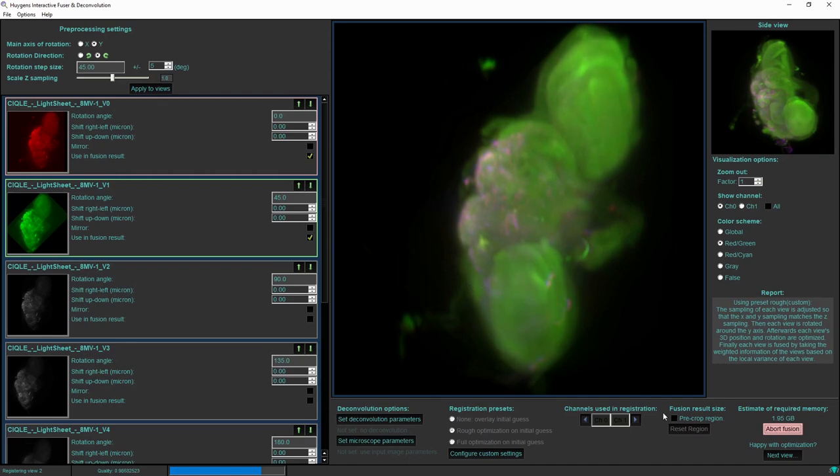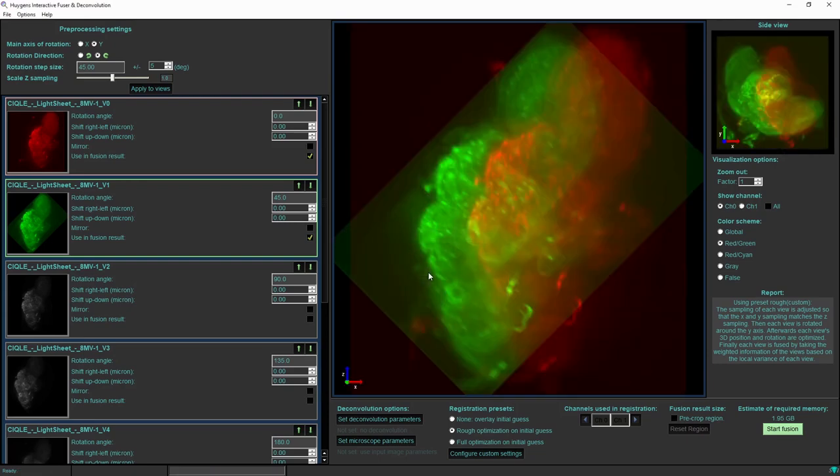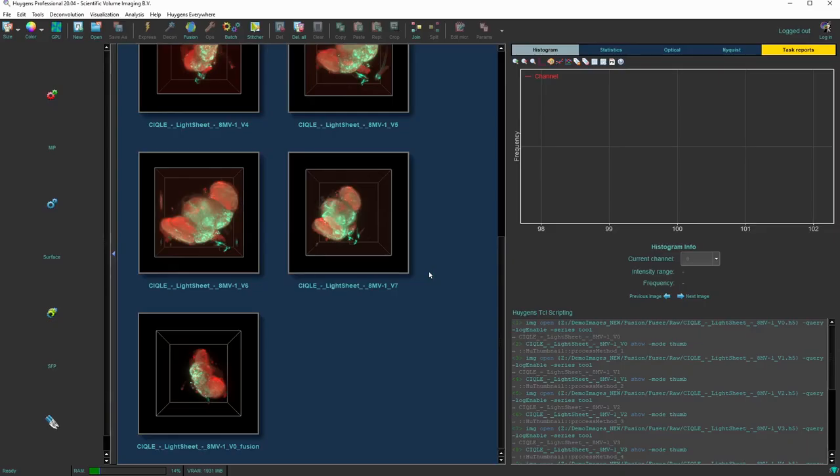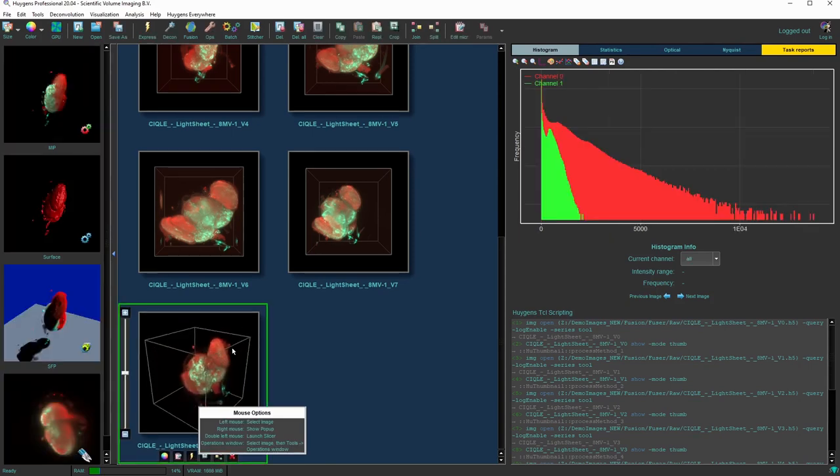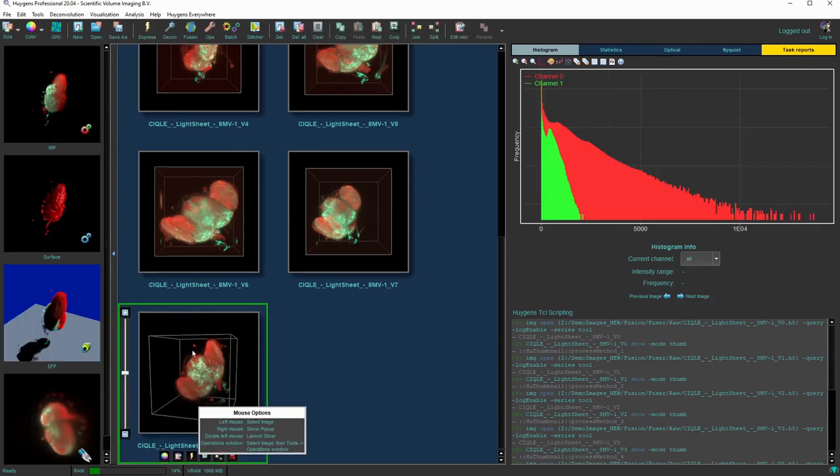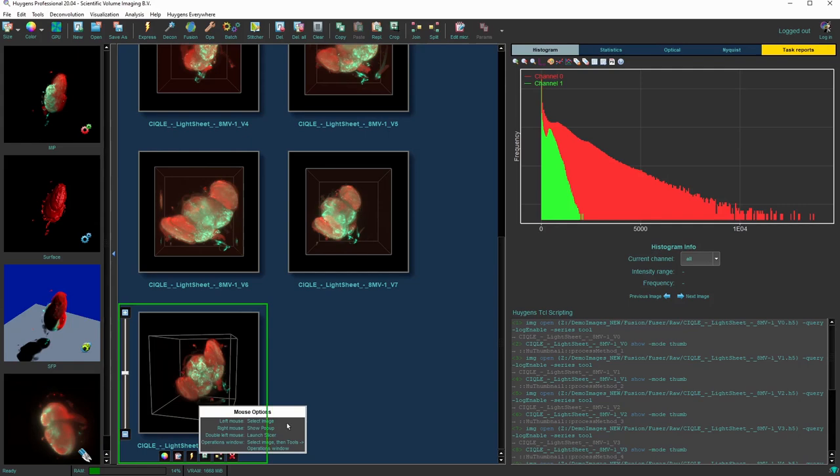So if I am happy with the overlap that it has found so far, let it fuse the result. And now in the main window, indeed we see that the background has been removed because now the background is black. Here we have a three-dimensional thumbnail of the fused image of just the first two out of eight input views.